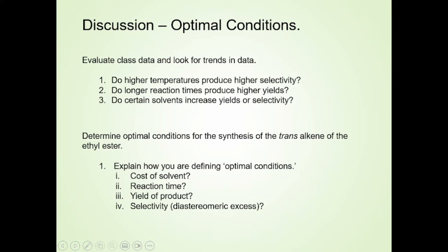And when you're entering stuff in the data table, it asks for first alkene and second alkene, not major versus minor, because it might be one set of conditions may give the cis as the major, a different set of conditions may give trans. So you'll put those in. But I think I've seen where people have transposed that. Maybe they actually had the data they entered.